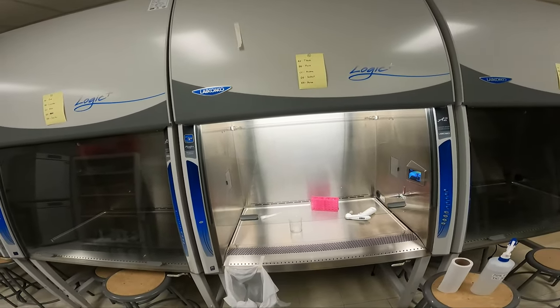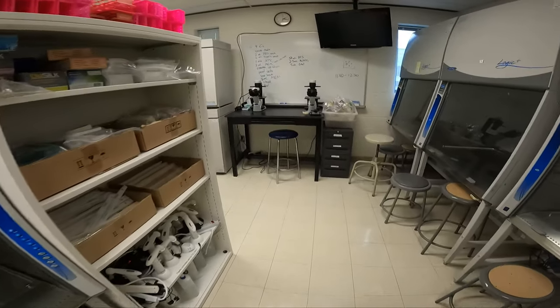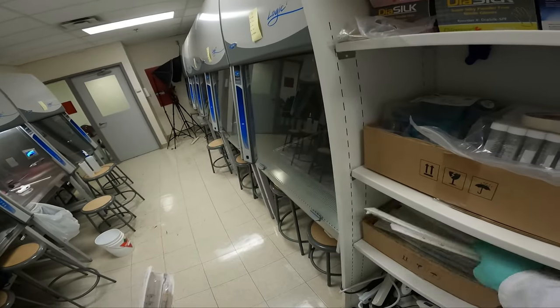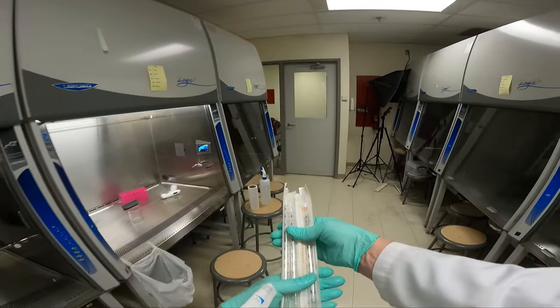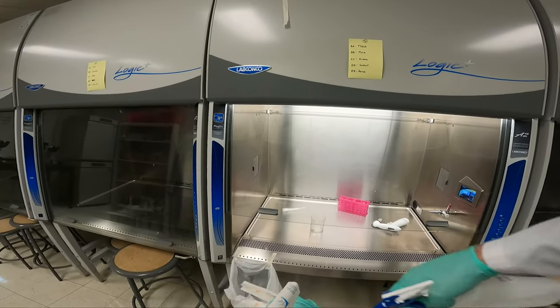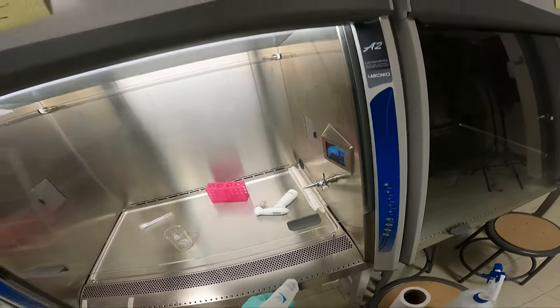Let's get some serological pipettes now. I'll grab a handful of tens and a handful of fives — I'm not counting them. If I take too many, I can put them back; if I don't take enough, I can always go back for more. We'll spray those down with ethanol and gently toss them into the hood.